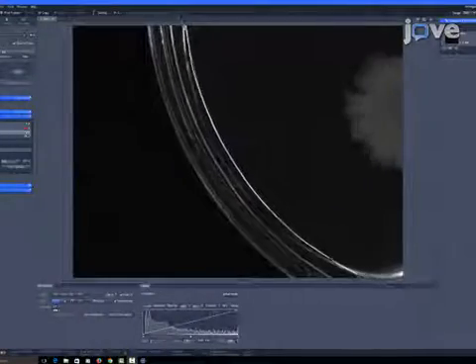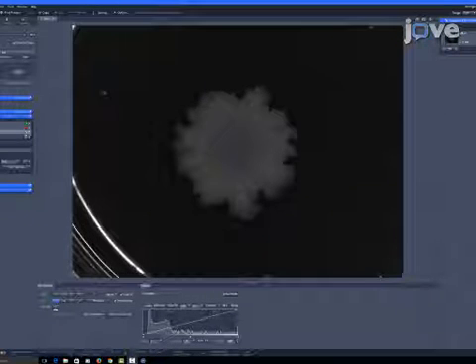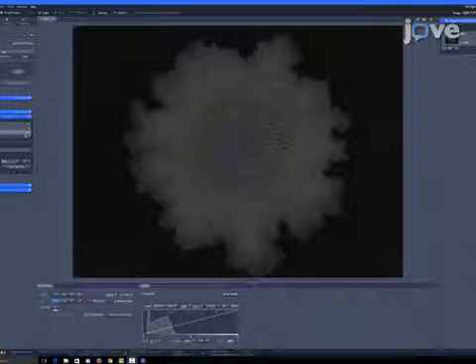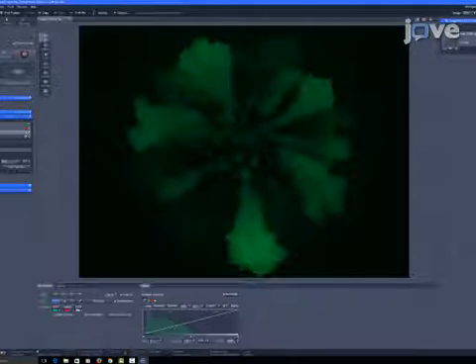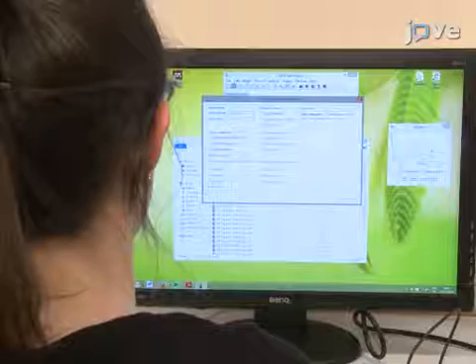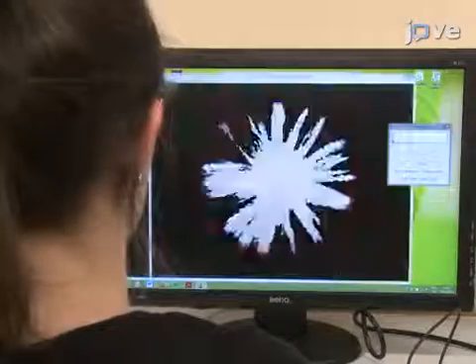For biofilm analysis, position a colony of interest in the center of the field of view. Set the magnification at the highest resolution that allows the entire colony to be viewed. Colonies are now ready for measurement and analysis. Finally, analyze the data as described in the text protocol.